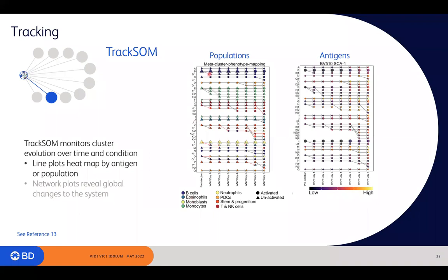So for example, here, you can see the B cell clusters, which are indicated by the dark blue fill. You can see that in the beginning, you've got, it looks like, 3 different B cell populations. After the first day of infection, you can see that first cluster splits into 2. Further down the line, on day 6, you can see that the original B cell cluster along this line again splits into 2, presumably because of the increased severity of the disease.